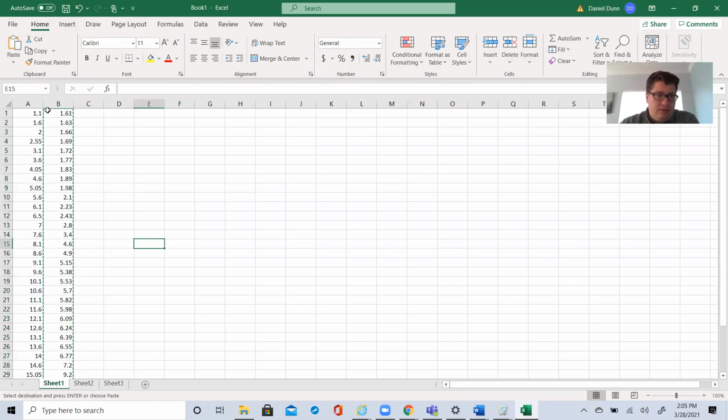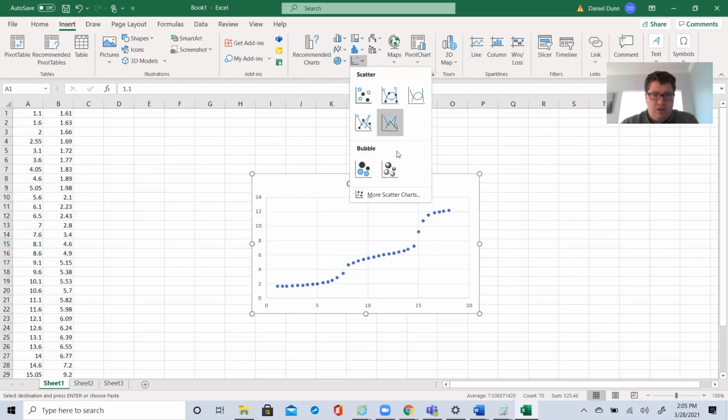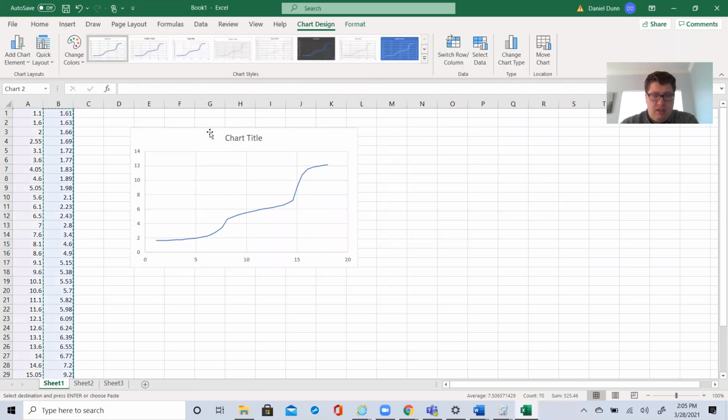So with Excel, you can take the data, go to Insert, go to Chart, and you can see a diprotic acid titration curve. You need to figure out what the equivalence points are. If using Excel, you can use the graphical method, which basically you're going to, with a steady hand, draw a line here, draw a line here, draw a line about in the middle point, and right there you would see your equivalence point roughly.